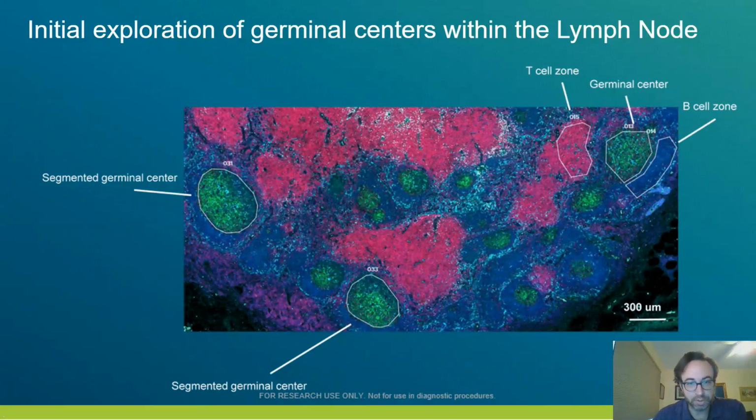Here we're showing an example of a tissue where we've got germinal centers that are these round structures, where we go in and profile those round structures and then segment them further. But we're also collecting mantle zone B cells, which are B cells that live adjacent to the germinal center, as well as T cell rich zones that are adjacent to the germinal center, so that we can understand some of the changes that happen between and across these different structures.